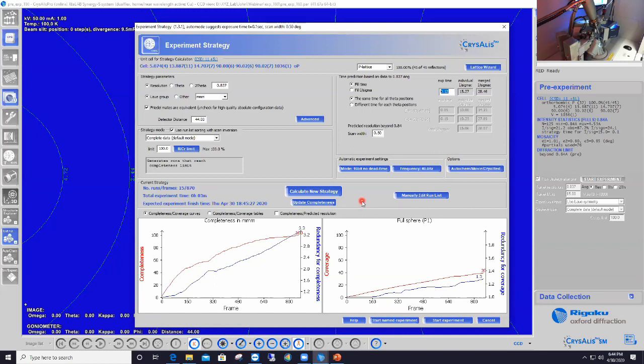For some of you students, your managers or your PI might ask you to always collect in triclinic. To do that, for the Laue group here, open up the pull down menu and select 1. That is the nomenclature, or rather the symbol, for the Laue group for primitive triclinic. So primitive triclinic is the lowest symmetry possible in the lattice, and that means that most of your reflections are not symmetry related with others.